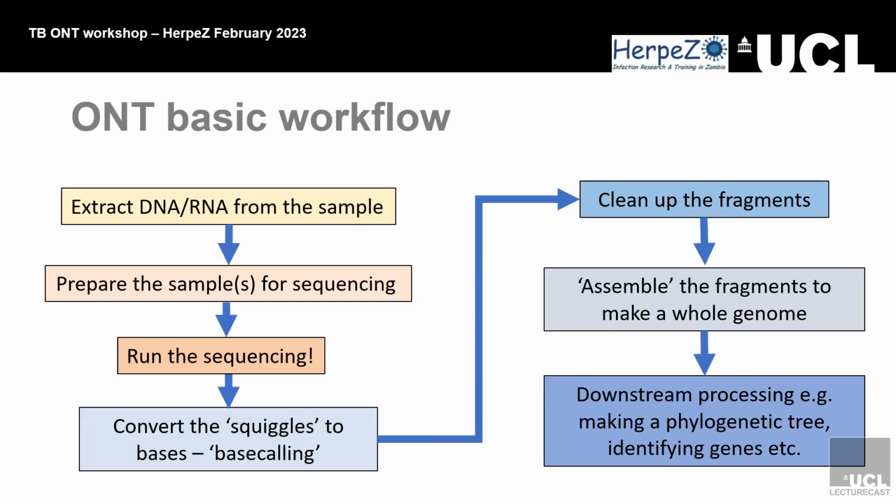All those sections in blue were the bioinformatics, or the computer side of things. It's showing you that if you are going to become a sequencing person, you're going to have to hopefully learn some of the bioinformatics, because it's at least half and half. It's very much spanning the two sides.